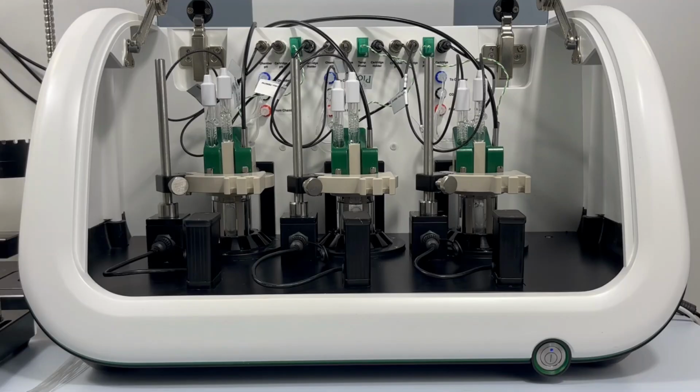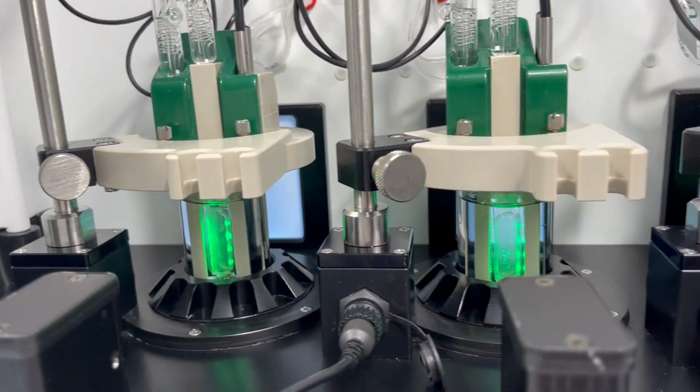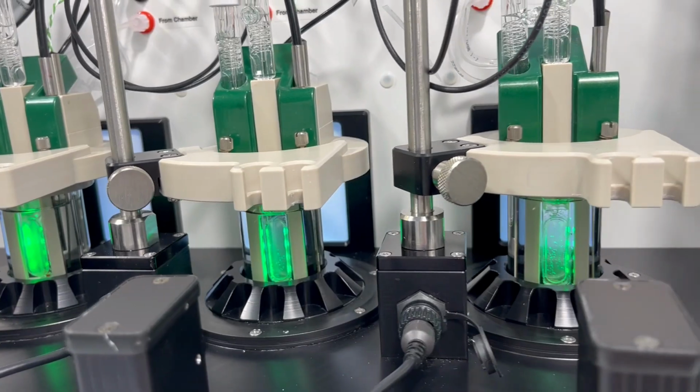So when we're ready, we'd start the analysis for each of our chambers in turn, and you can see all of the lights turning on. You can see the lights, the green light specifically for the transmission, and the backlight behind each of the chambers for the imaging.